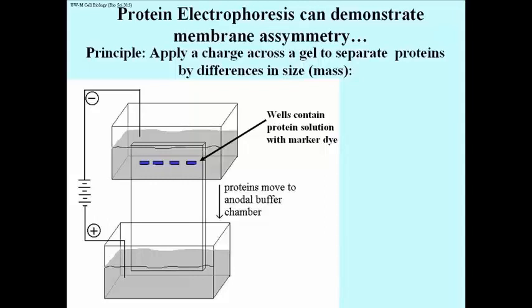We're going to separate these proteins based on size. So when we turn the juice on, there is movement towards the anodal buffer chamber. Now what you saw moving was a blue dye that we threw in to the protein solution, so that we could follow the electrophoresis until the blue dye reached the bottom of the gel, and then we turn it off.